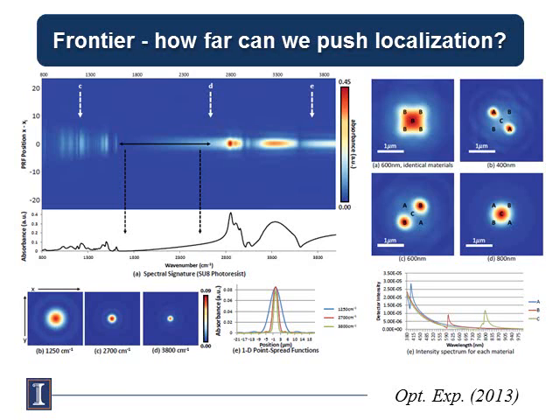If they're not orthogonal, then the trading rules become a little bit complicated, depending on the spectral overlap and on the signal-to-noise ratio. So the trading rules for IR microscopy are really different compared to optical microscopy, and it's something that is still an open frontier, and we don't know how far we can push this.